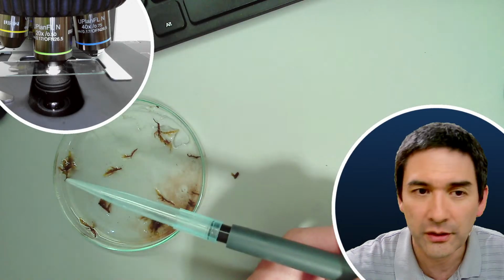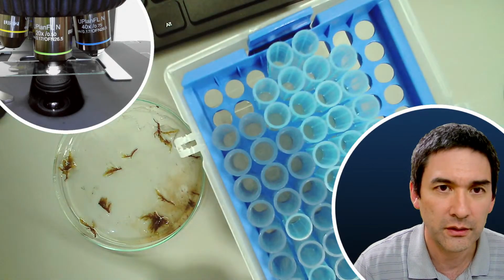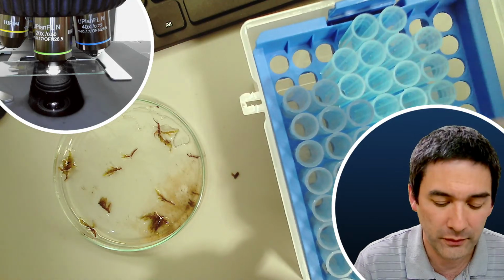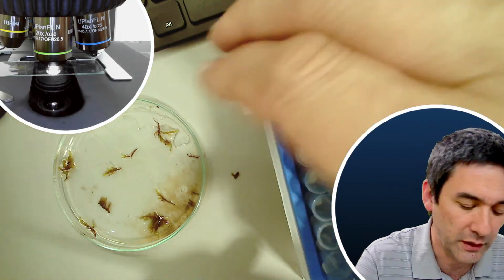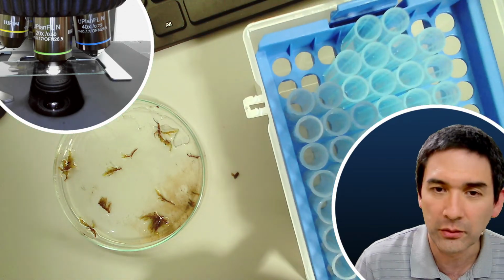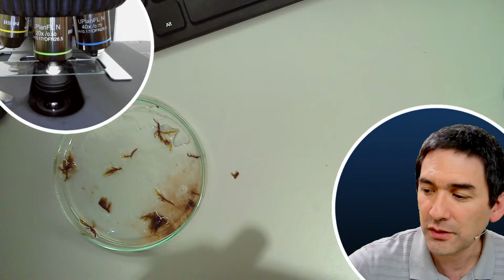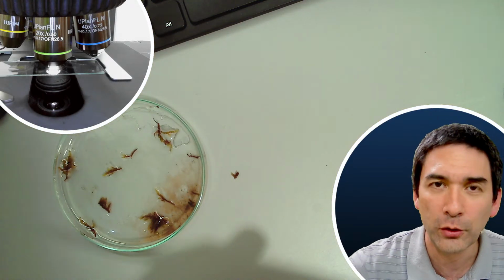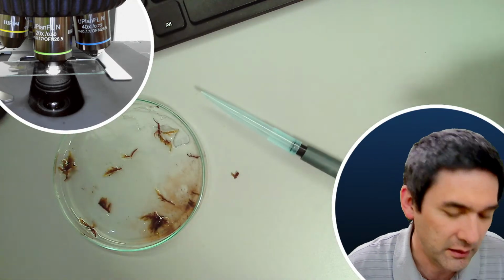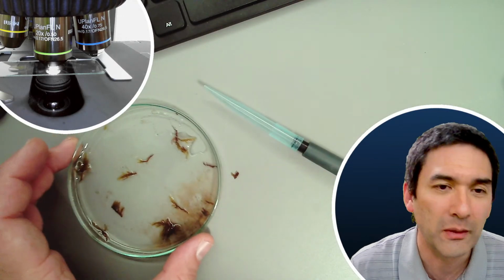And what I've got here is, I can show you, a box with pipette tips, and I bought myself also a bag of these pipettes. I removed the lid here, because it's easier this way and it doesn't have to be sterile either. If you worked in a microbiology lab, then you know that this has to be always covered and sterile, but that's not what I need to do here, because I'm just doing microscopy work.